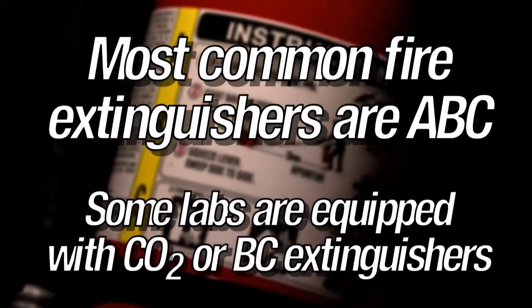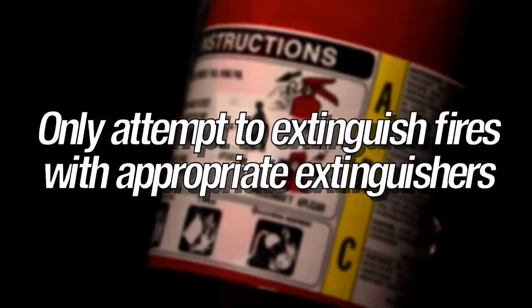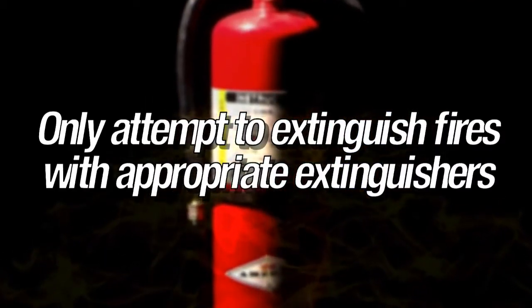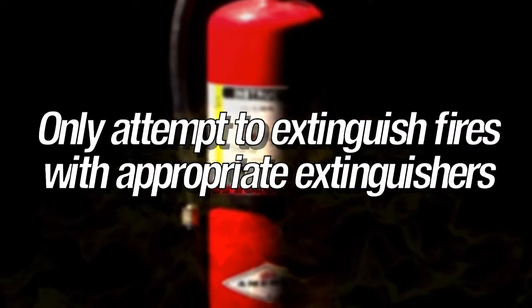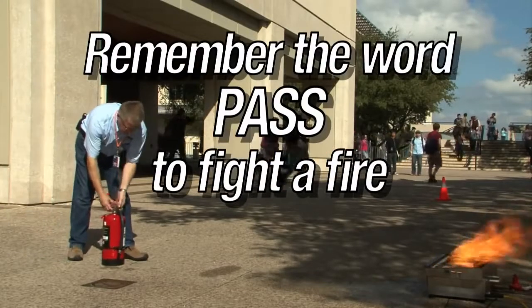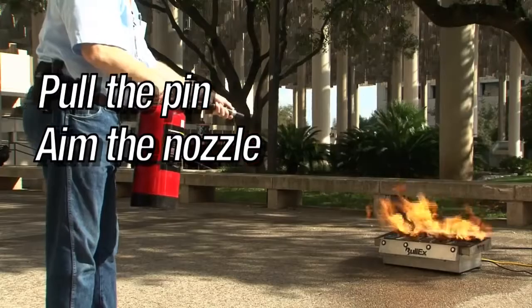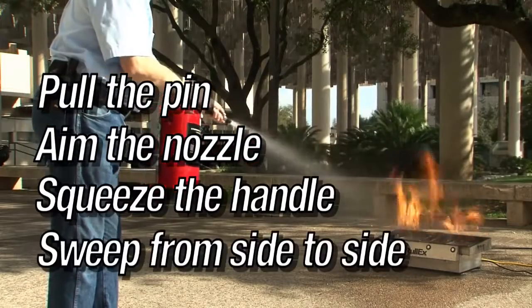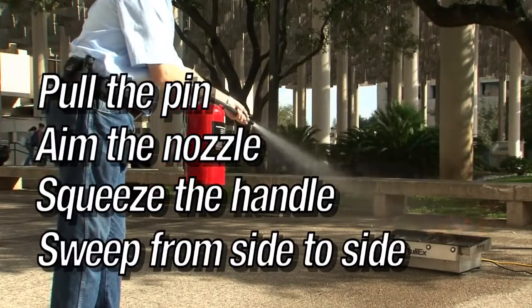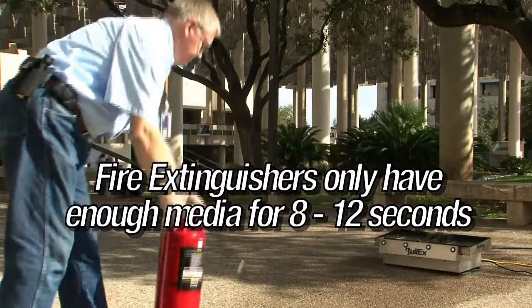The most common type of fire extinguisher on campus is ABC. Some labs are equipped with CO2 or BC. Only attempt to extinguish small fires that you feel comfortable fighting and use the appropriate extinguisher for the type of fire presented. If you choose to fight a fire, remember the word PASS. Pull the pin, aim the nozzle, squeeze the handle, sweep from side to side. Remember, a fire extinguisher only has enough media for 8 to 12 seconds of operation.